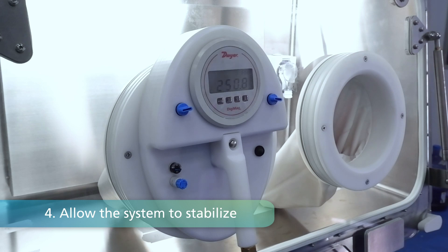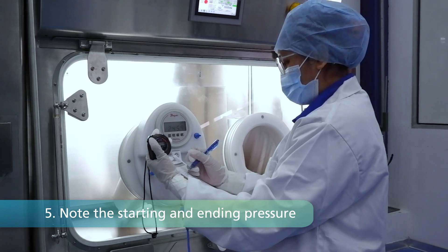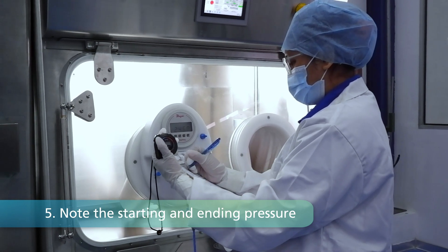Step 4: Allow the system to stabilize, reaching either 250 Pa or after a 2-minute stabilization period. Once stabilized, commence the timer, noting the starting pressure. Step 5: Record the end pressure after the 5-minute mark.